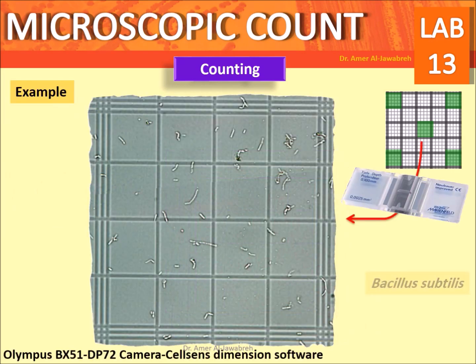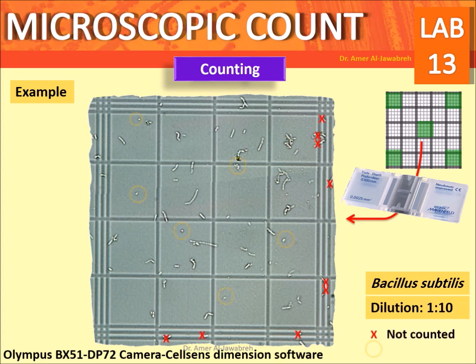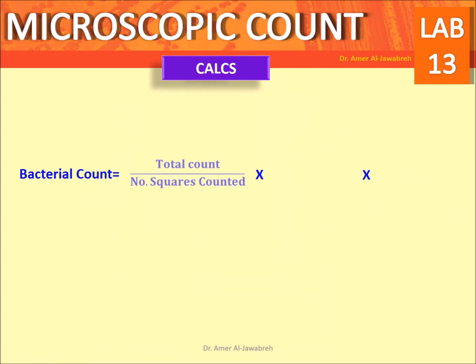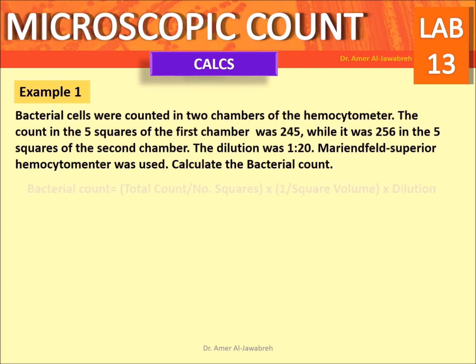Counting example using Bacillus subtilis at a 1-to-10 dilution. Artifacts are not counted. The calculation equation is: bacterial count = (total count / number of squares counted) × (1 / square volume) × dilution factor.